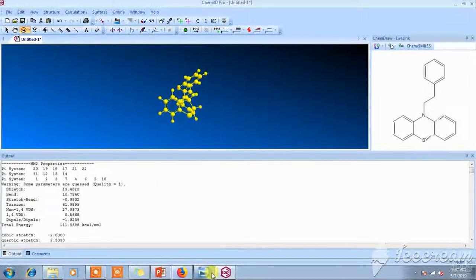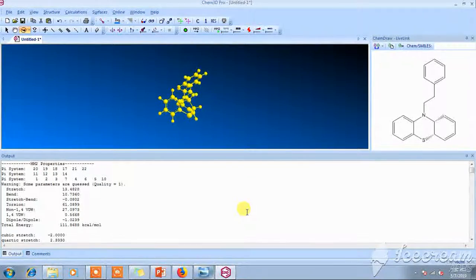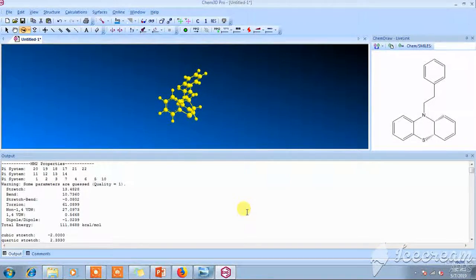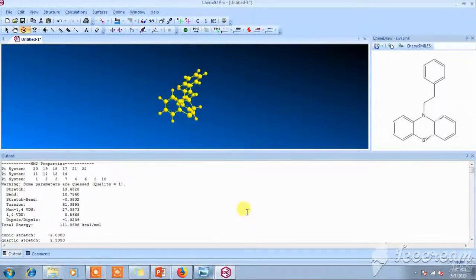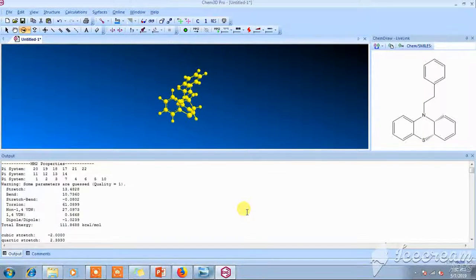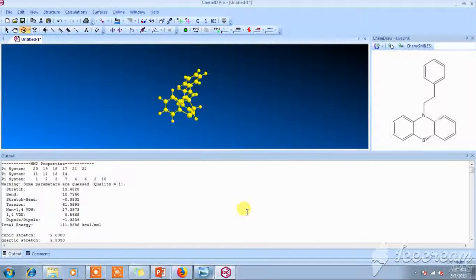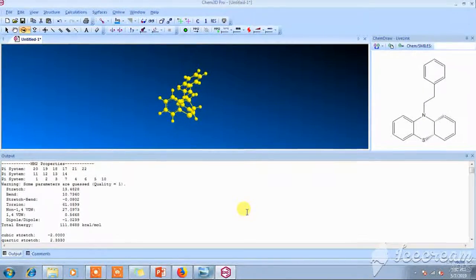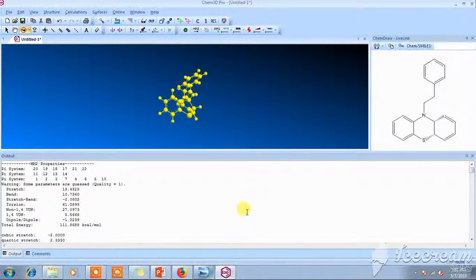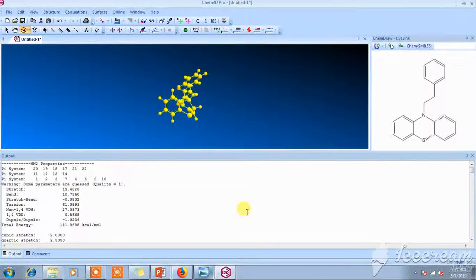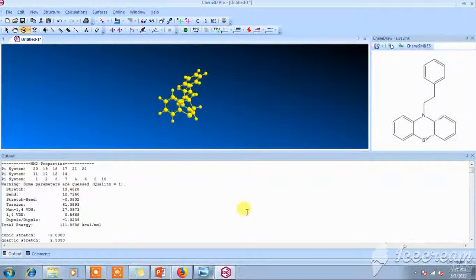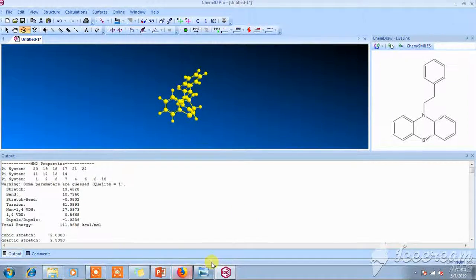Parameter, just go to the Excel generation of QSAR model by the Excel sheet. I have already uploaded that video. Please see that video for generation of the model. These parameters you can easily use for the generation of QSAR model.